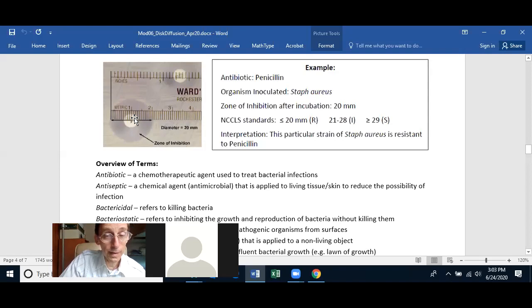Okay? Any question about that? Did I confuse anyone? You do measure the disc when you take your zone of inhibition.